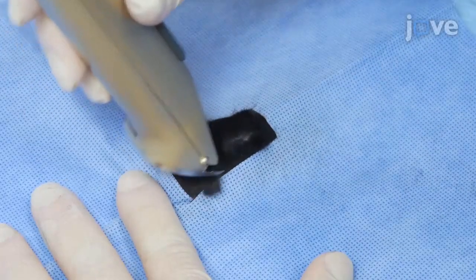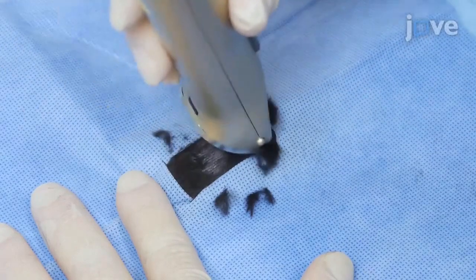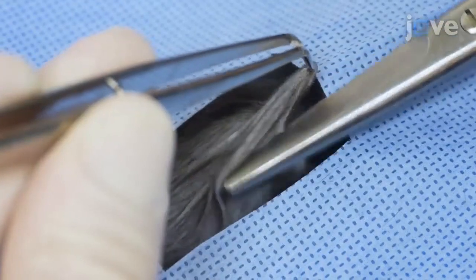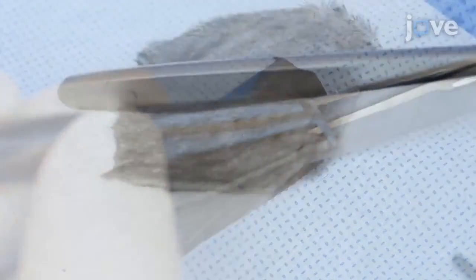To begin this procedure, remove the mouse's hair with an animal hair trimmer. Make an incision on the skin of the back using scissors. Then lift the skin up and cut it away.